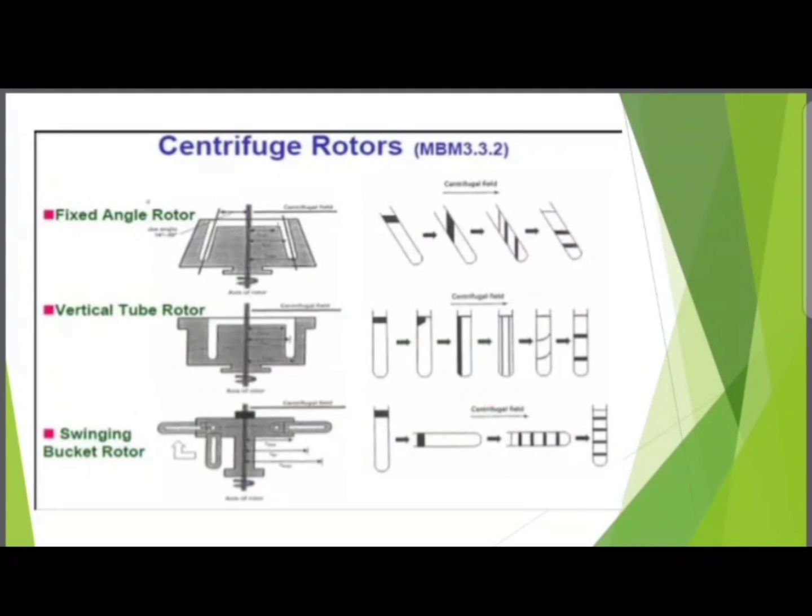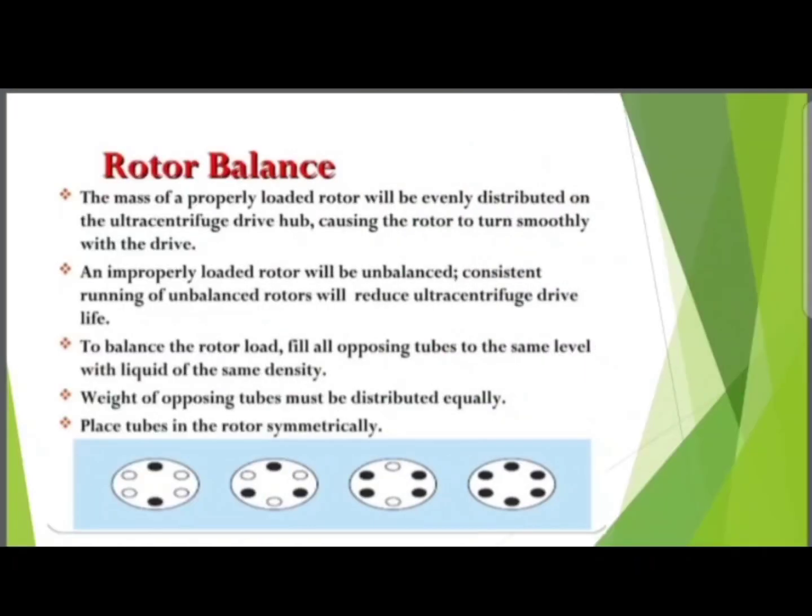Here are the features of the three types of rotor: fixed angle rotor, vertical tube rotor, and swinging bucket rotor. The last topic is rotor balance.